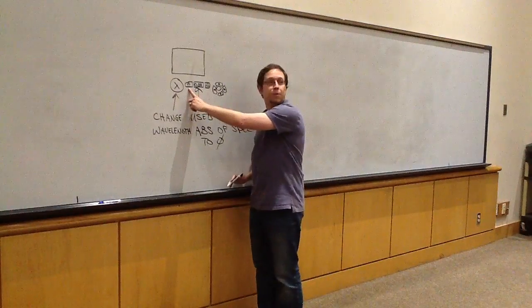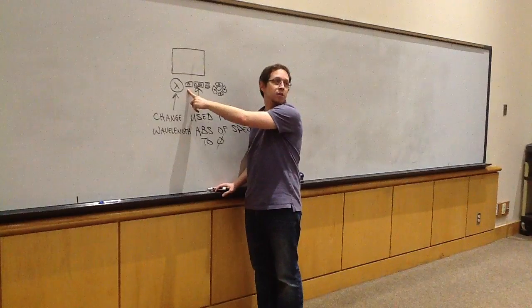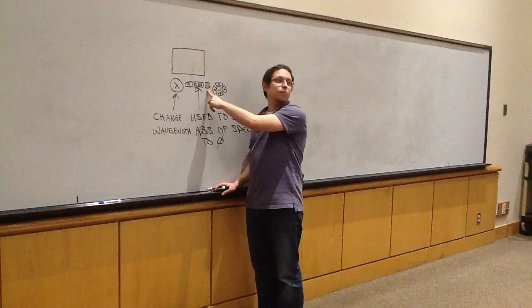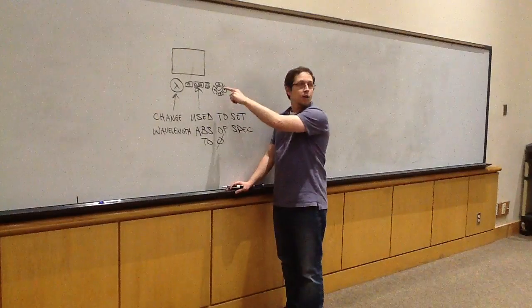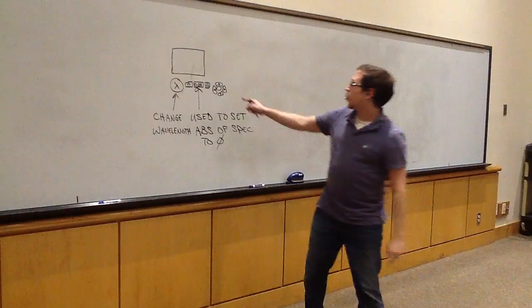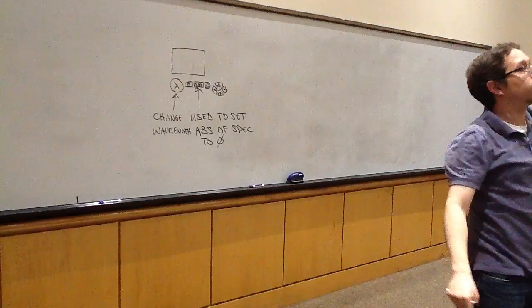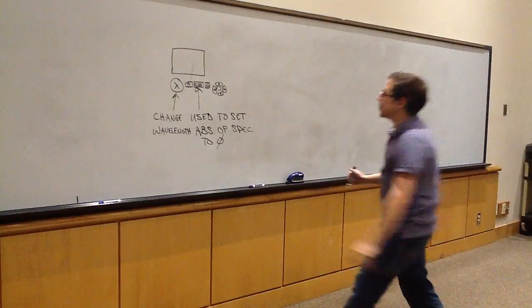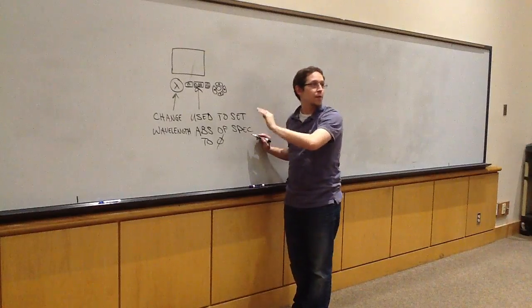Sure, absolutely. This button here is the home button, and it takes you to the home menu. Okay? This button over here is the print button, which you guys didn't use. It's just used to print the screen. And then here, you have a circular button in the center, and around it you've got 4 angular buttons that point in different directions. It looks like a compass rose. One points up, one points down, and the other 2 point in opposite directions. Okay? These buttons were typically just used to navigate through the menus. So again, not really that big of a deal.